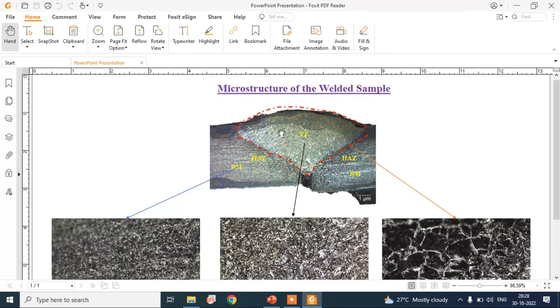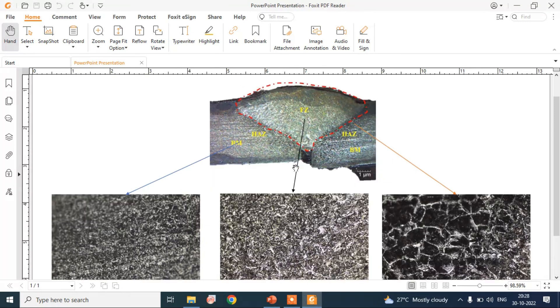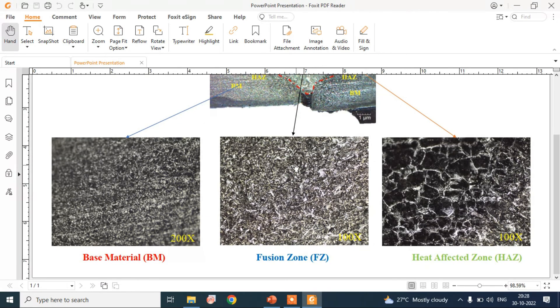So this is our microstructure of the welded sample for the corresponding regions. Thank you.